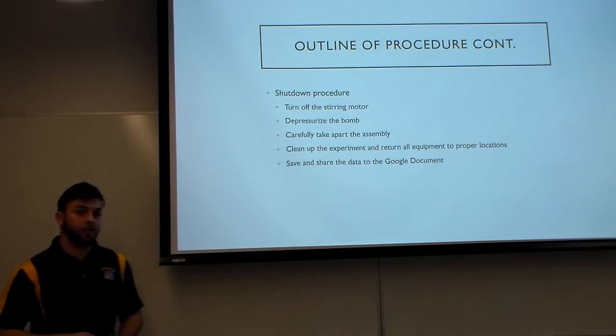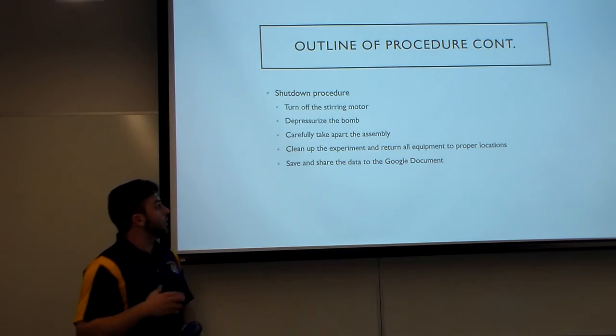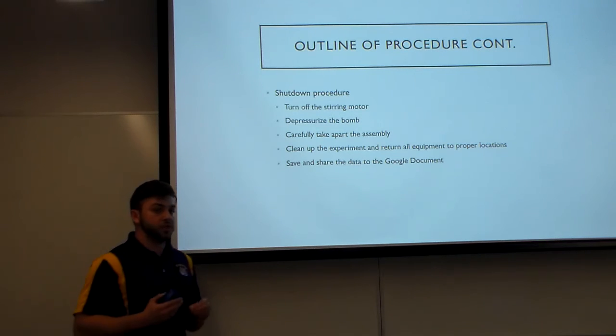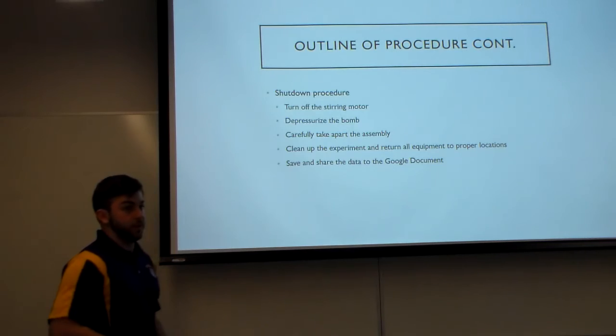Shutdown procedure, we want to make sure that we depressurize the actual system itself. We want to slowly depressurize it, because if we open it too fast, we create positive pressure, we get an actual bomb.